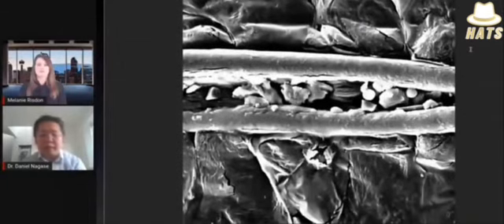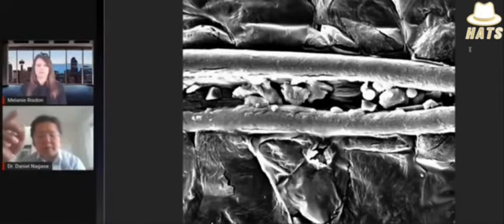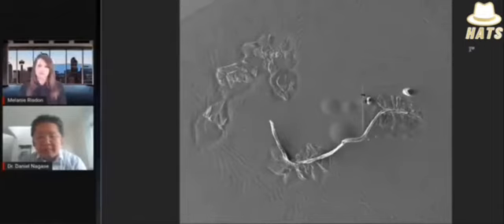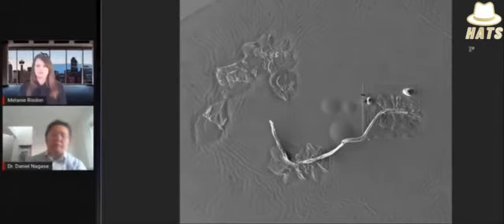So if we zoom into the folded over part of that strand, if we scroll up again, if you look at the right-handmost part of the strand, it looks like the strand is folded over, and the folded over part of the strand appears to be sitting on top of a crystal. So in the middle of that strand, there are some little things that look like dots in between the folded over parts of the strand. So when we scroll down, we're going to take a closer look at that.